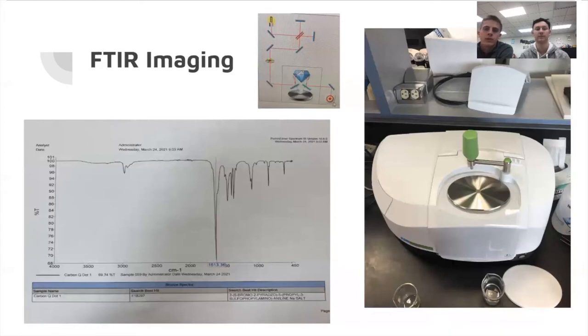Another test we did was using FTIR imaging, and this was done at the University of Pikeville with Dr. Hess. We placed our sample on the machine here in the bottom right, and this device takes light and puts it through a diamond, and the light emitted from our substance shows the compounds within our solution. What we collected here over on the bottom left is a graph showing this large peak, which is a carbon-oxygen bond, which is exactly what we're looking for in carbon quantum dots.